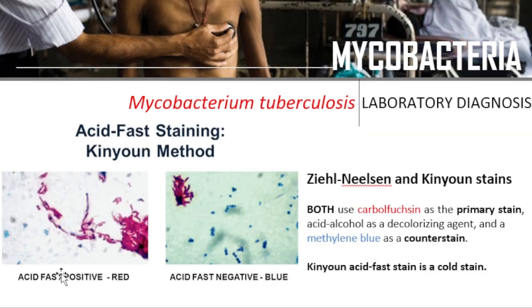tuberculosis. Now, gram staining for Mycobacterium tuberculosis won't work, because their cell wall is like a wax raincoat. Remember, what is in their cell wall? The mycolic acid. The dye of the gram stain just slips off their cell wall. Instead, we use the acid fast staining.